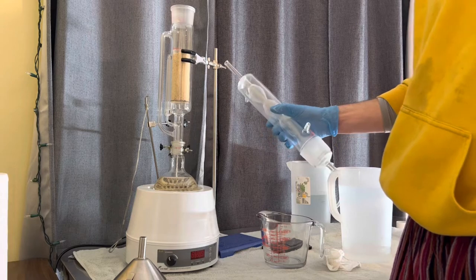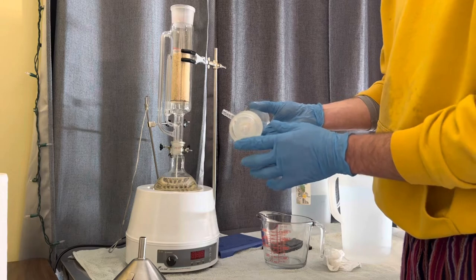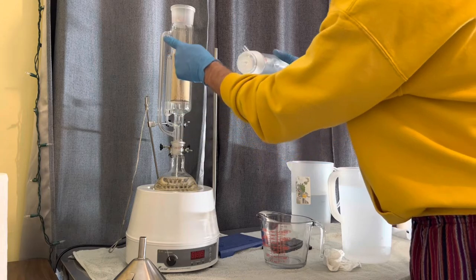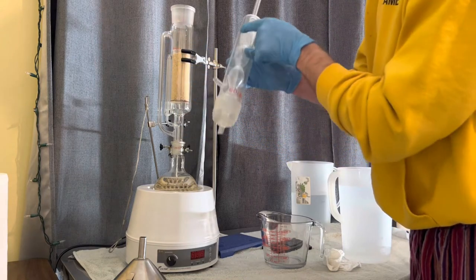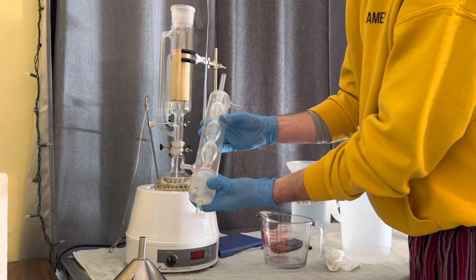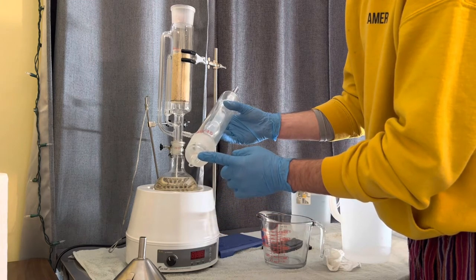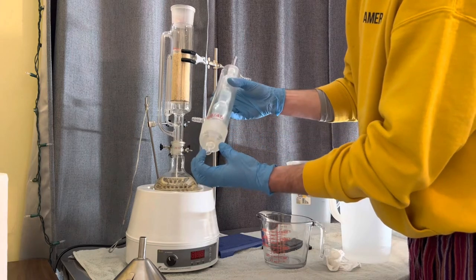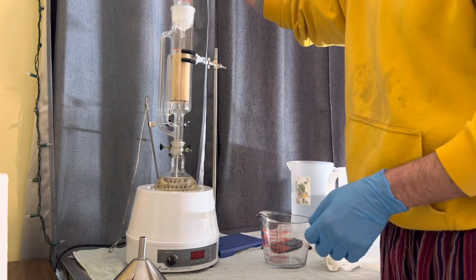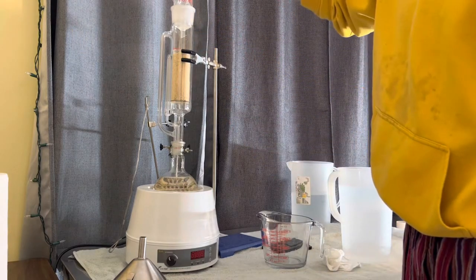So now that we've had that assembled, this is our condenser. This is where the hot vapor that comes up through this tube will touch. This condenser here will be filled with circulating cold water. When that vapor hits this cold, it turns it back into a liquid. So it drips down off of here and into here, and I'll show you that later. So we've got that on. Now the next thing to do is fill our condenser up with cold water.